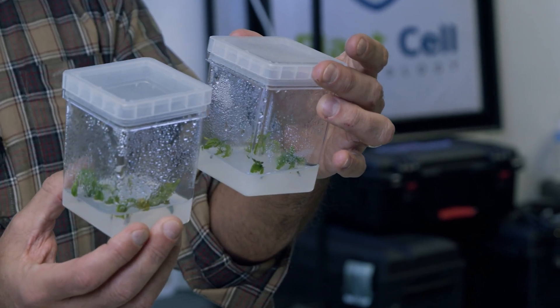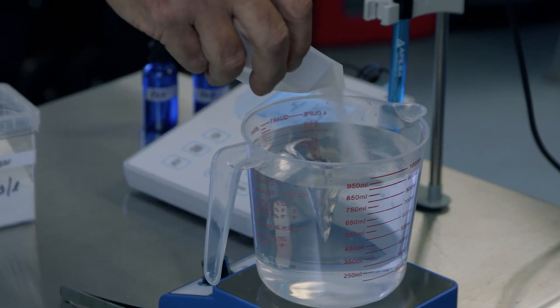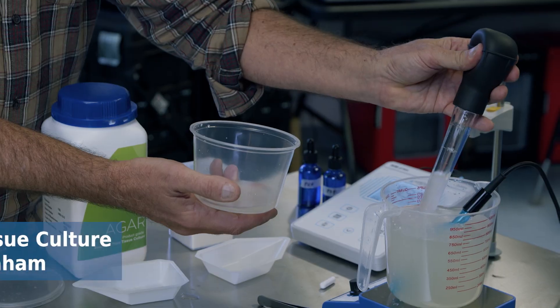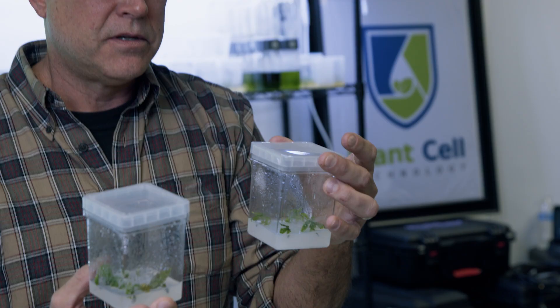This is what we'll be making. Tissue culture at its very simplest is growing plants with sugar. One cup becomes four cups, becomes 16.